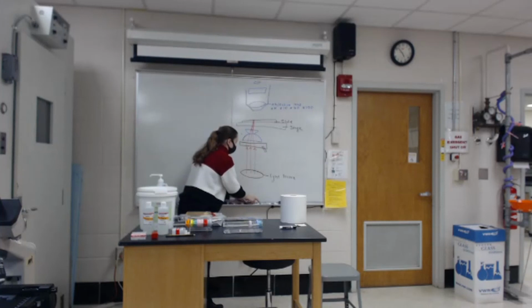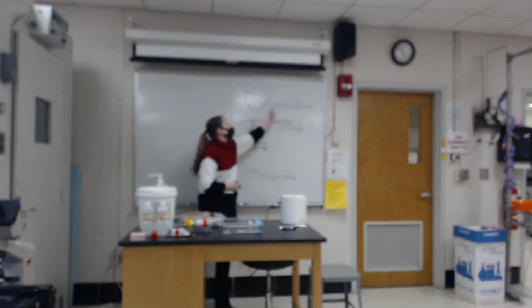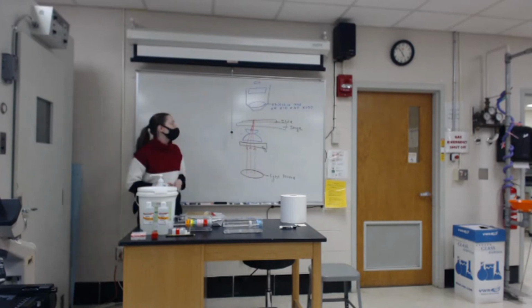So what happens as light is shining through the slide? Let's say we're looking at either the scanning, low, or high power lenses, which use air as a separation, or a medium, for the light to travel through between the sample and the objective lens.